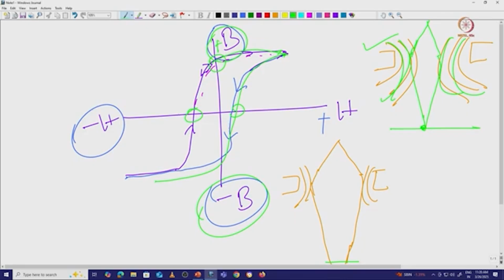These things are very important when we are constantly changing the magnification, because in magnification also we are using electromagnetic lenses. We use an intermediate lens and two projector lenses, which help us magnify our images. Sometimes we use a weak magnetic field to get a low magnification image, and with the same lens we use a very strong magnetic field to go to very high magnification. That is the time lens hysteresis is a problem.